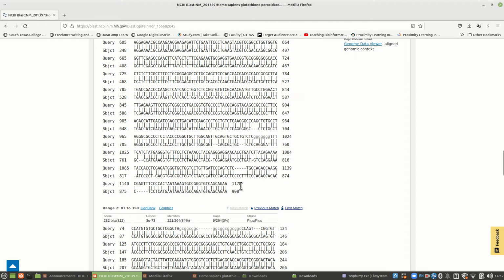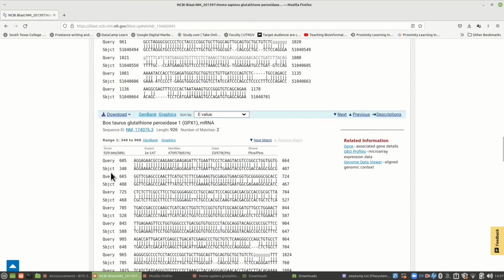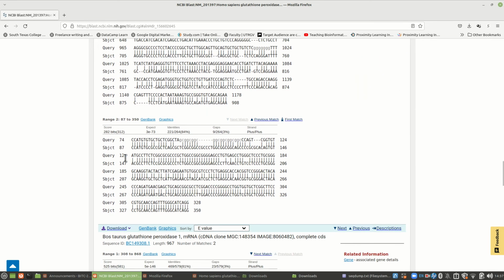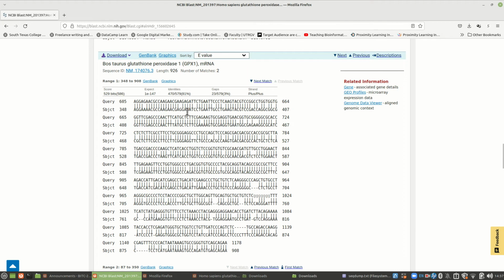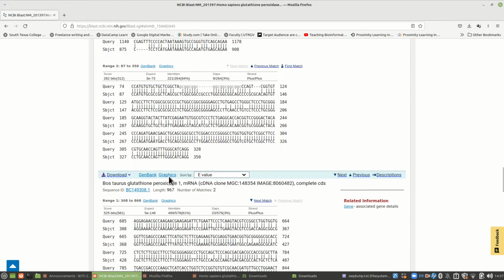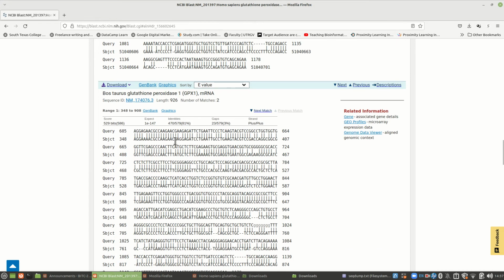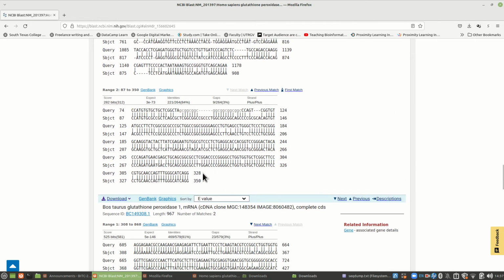Notice on one of them, you go from 908, 350, and this one starts. So there's a big chunk cut out of these. In other words, notice that this one stops at 350 and starts back up. Well, that is 350. So it is pretty continuous. Apparently, the computer program they have distinguishes something different in that area and decides to break it up at 350. Let's see, 605. But this one is only 328. So there's your difference.